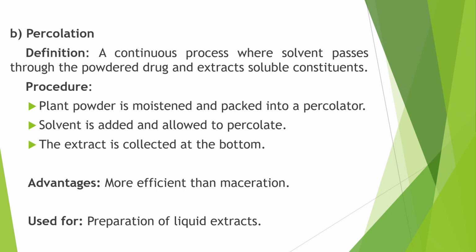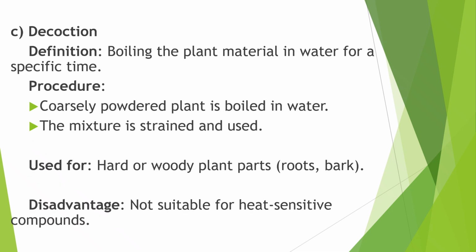There are a few advantages, but the most important advantage of this process is that it is more efficient than the maceration process. And as far as the use of the percolation process is concerned, the preparation of liquid extract becomes much easier by using such an extraction process like percolation.